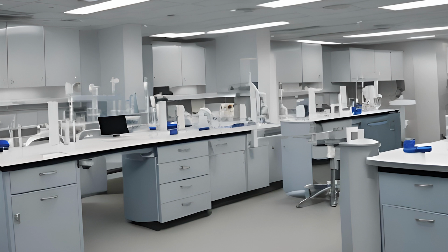Errors that can occur during your specimen processing can be a delay in processing or testing, or the improper processing of a sample. If someone allows the sample to evaporate, or if there's clots in a plasma specimen, if contamination from other specimens gets into that sample, or glove powder.